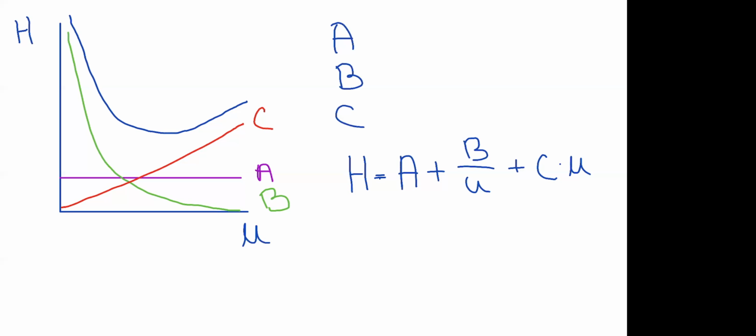Firstly, because both the eddy diffusion and the resistance to mass transfer depended on the particle size, they also depend on how well the columns are packed. Resistance to mass transfer also depended on the thickness of the stationary phase. So we know that we don't want to have too thick a stationary phase as well.